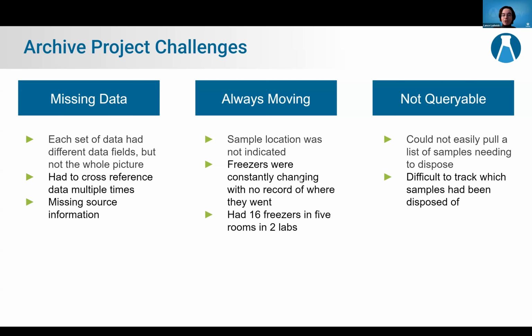So I think moving forward, it's important that folks use Sample Manager to its fullest so they can tackle these really daunting projects, help keep track of where these samples are that you need to dispose of, and just make sure that you know exactly where everything is going.